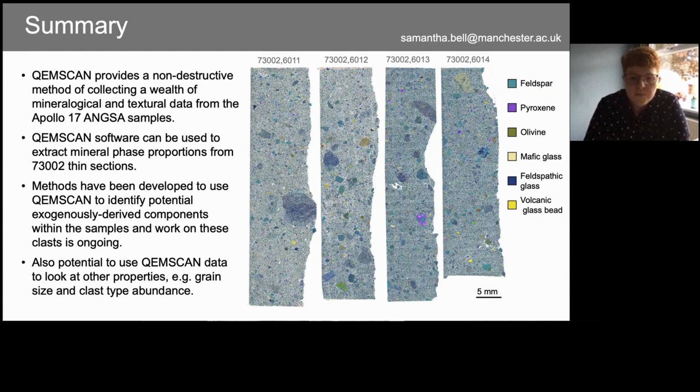So I think some of them were probably Mg-suite material, for the high forsterite olivines. In terms of the other phases that were in the clast as well, flicking back between the meteorite phase list that we've got and the full phase list, we can see that the clasts are unfortunately not looking like meteoritic material, but probably some sort of Mg-suite material.